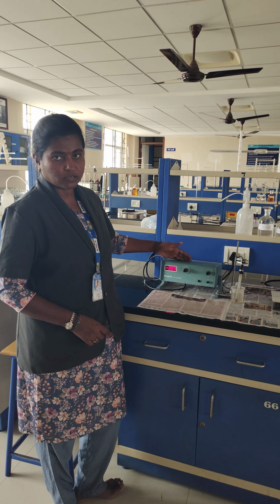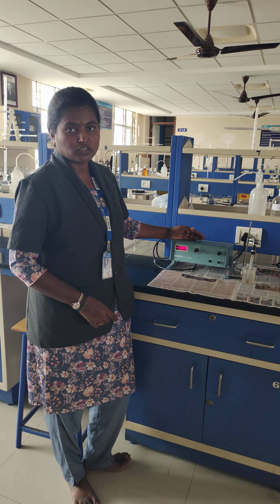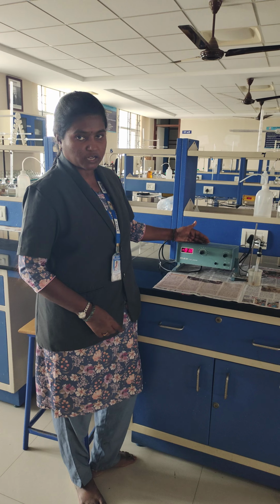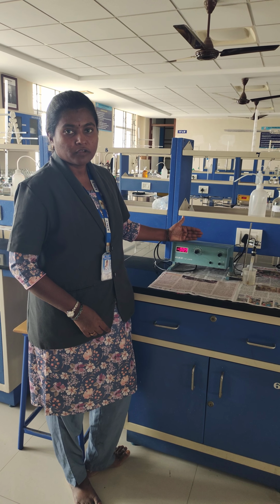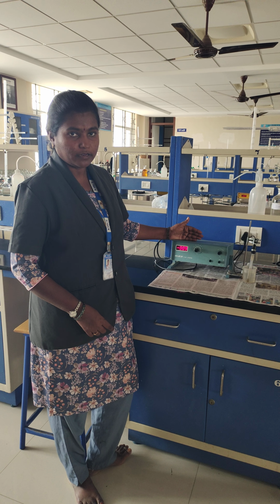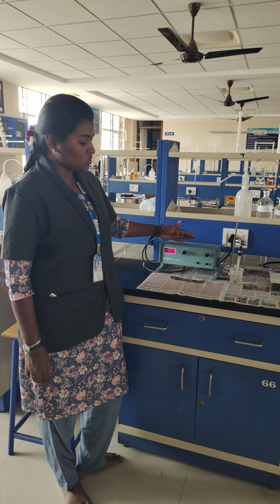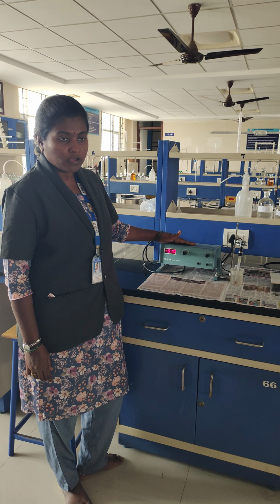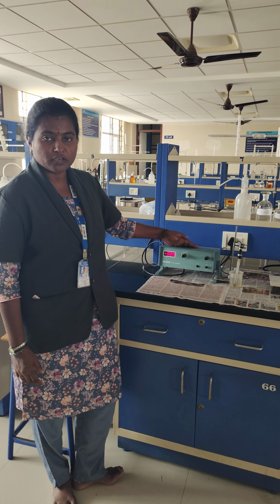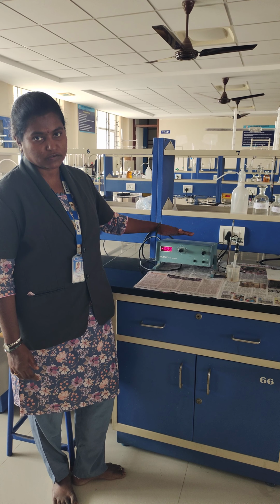pH metry experiment. This is one of the electrical experiments conducted for the chemistry for engineers paper. This is an application-oriented experiment. pH metry is the acidity and alkalinity measurement; whether a solution is acidic or alkaline can be determined by using this instrument. It is termed potentiometric pH metry because this meter measures the potential difference between the reference electrode used in this experiment as well as the ion selective electrode.